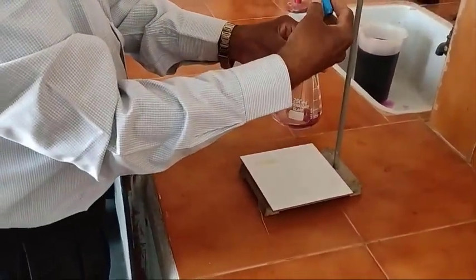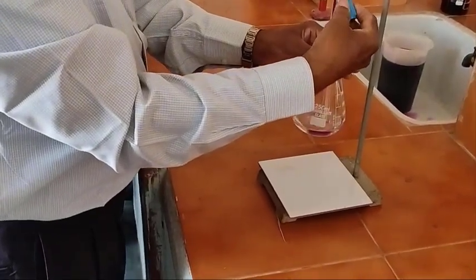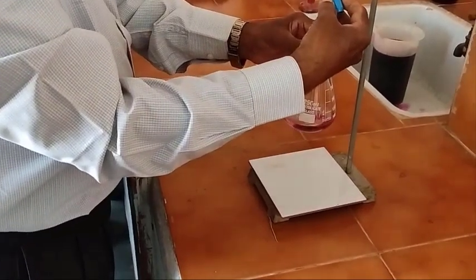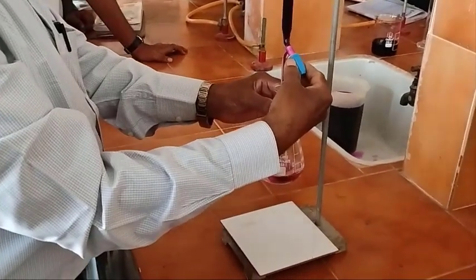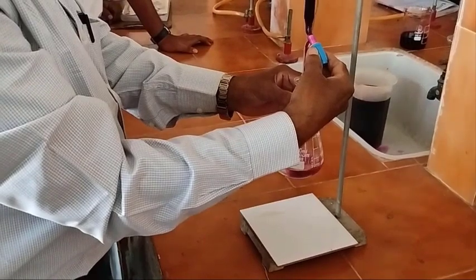Because the temperature is very high now, even if I do not shake, the color is disappearing because the rate of the reaction is almost double. That means 100%. In the first titration, of course, we may have to add more amount of permanganate. Sometimes the burette may be filled a second time also.